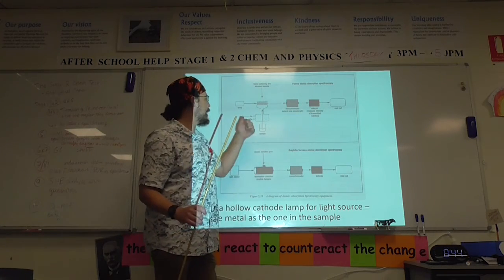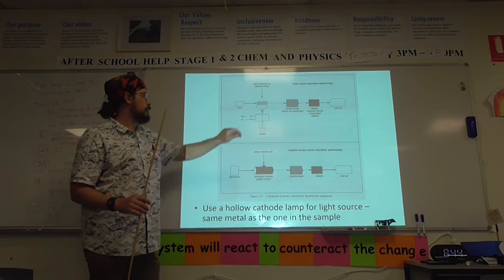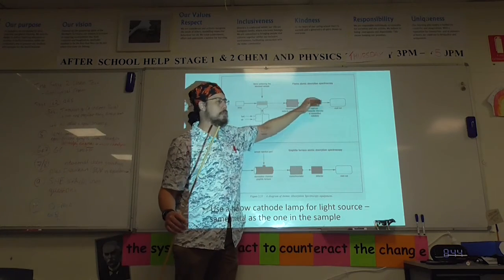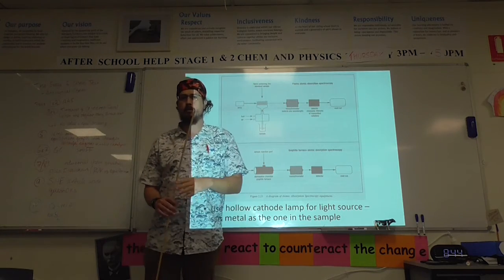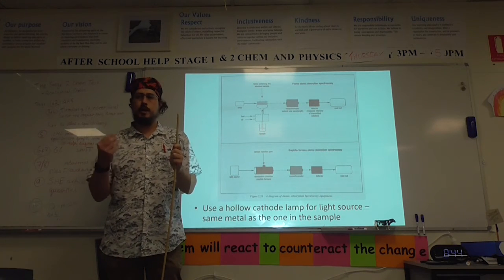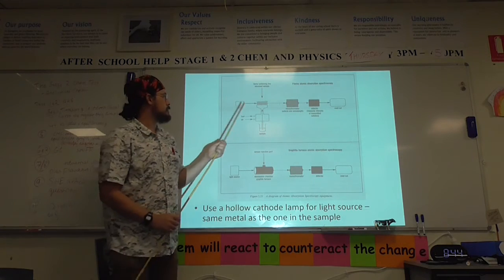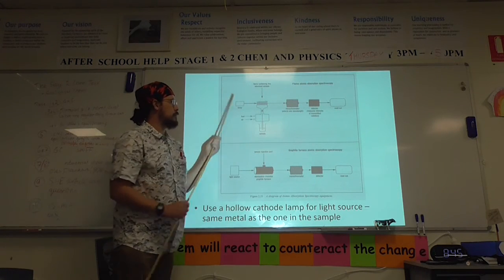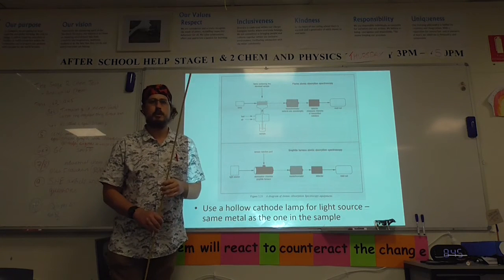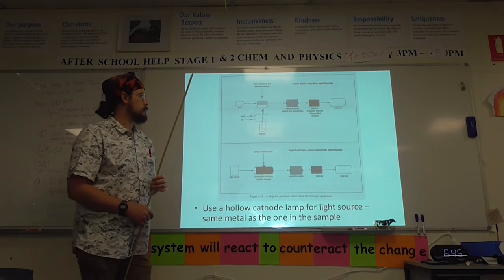And then you start to add the metal sample. And as you start adding the metal sample, it'll absorb some of the light, and instead of going to the detector through the monochromator, it starts to go off in random directions. And it's no longer detected, because it doesn't absorb the light and keep it. It absorbs it and immediately drops it back down and releases it again, but it's going to be releasing here all over the place instead of going to the detector. Sure, the odd photon will hit the detector, but an insufficient amount to register any credible difference.